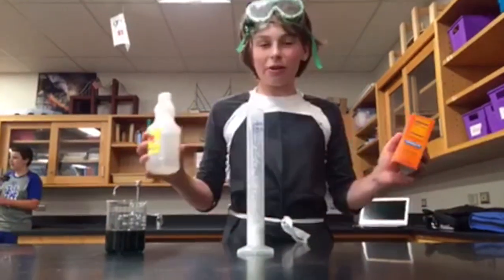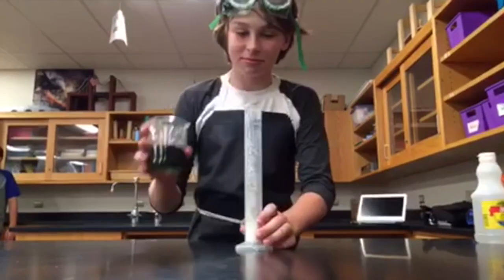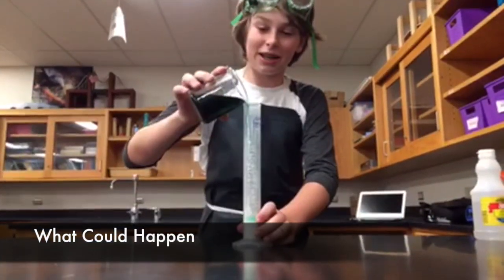Alright, so I've ground these two chemicals while the teacher was away, so I'm going to try it. Christian, don't mix the chemicals! Too late.